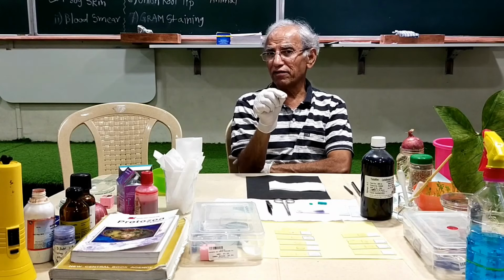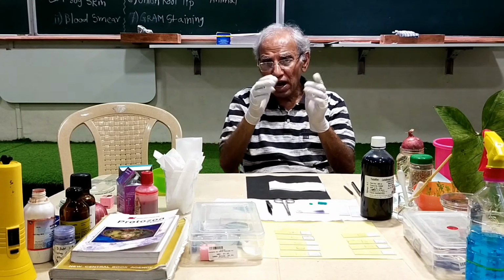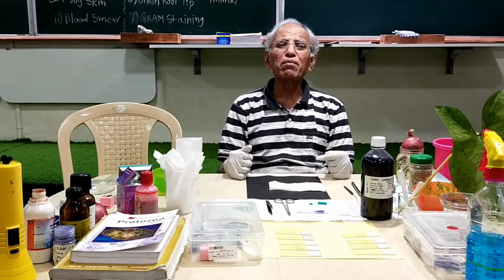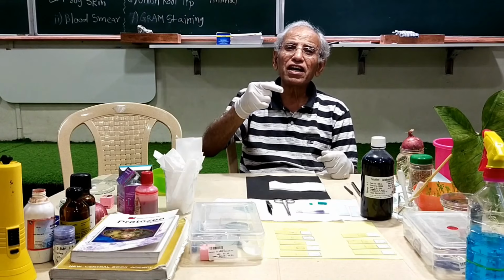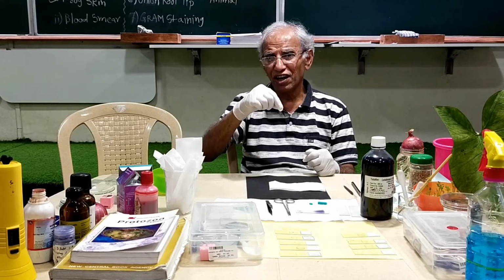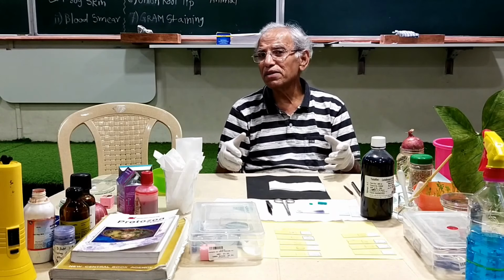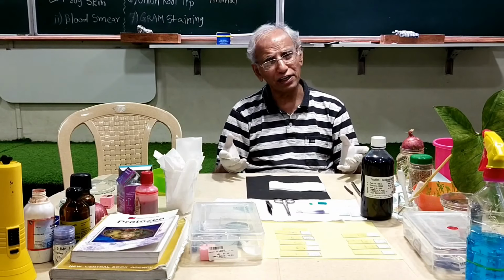And you know, the speciality of the RBC is that it is circular, not spherical, circular and biconcave. Human, mammalian RBCs are circular and biconcave. Under the microscope, you may not be able to observe the concavity. You may mistake the concavity as a nucleus because the concavity will provide a kind of shade in the image. But that is wrong, because mammalian RBCs, human red blood cells, do not have a nucleus, that you know very well.